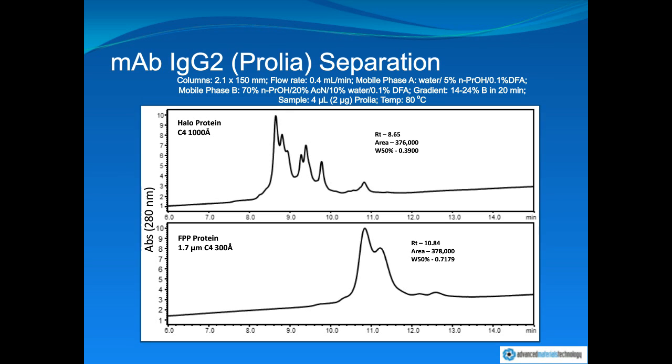There's glycosylation variants, but the primary structure itself is within 10 mass units, isobaric structures. So these are not variants at the polypeptide or the glycosylation level. These are, in fact, variants at the disulfide bridging.